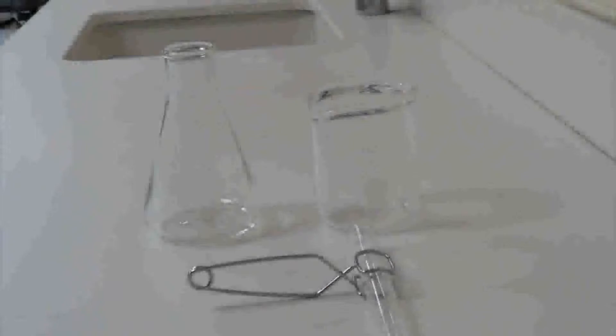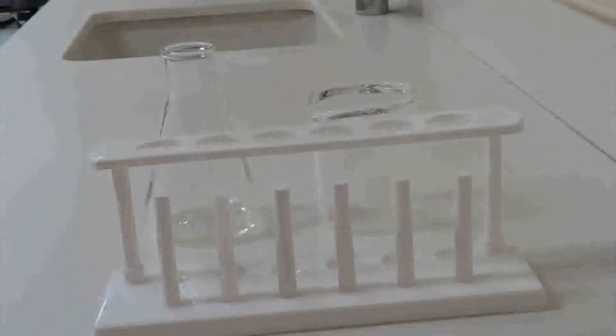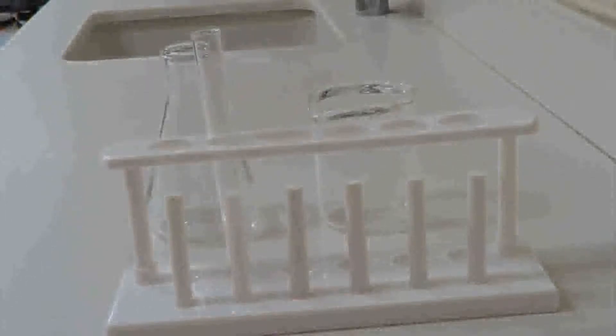You'll notice that a test tube won't sit up by itself. We need specialized equipment just to help a test tube stand, so we have a piece of equipment we call a test tube rack. These are what most of our test tube racks look like. Notice that at the top, you have this area with holes in it. The test tube will sit right down in that hole, and then will stand on its own so that you don't have to keep holding it. You'll also notice these pegs on the front of the test tube stand. What these are for is when you are done with the test tube, and you need to let it dry after you've cleaned it, you can turn the test tube upside down and allow it to dry.